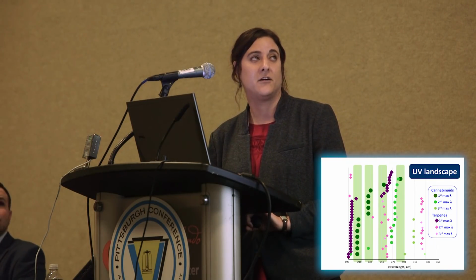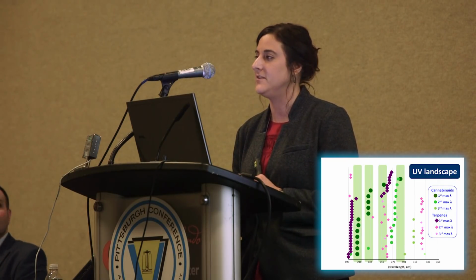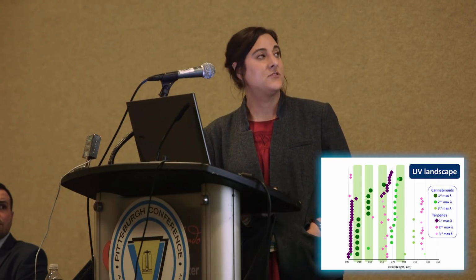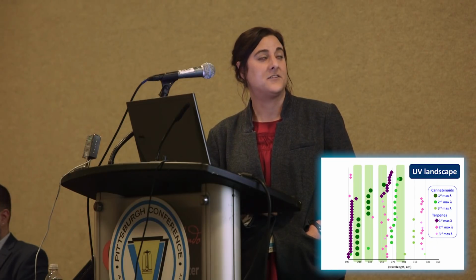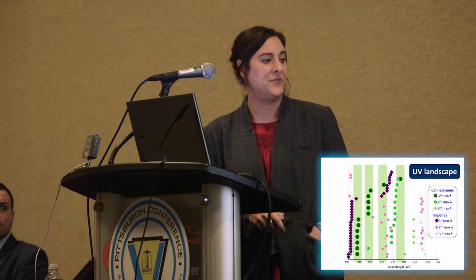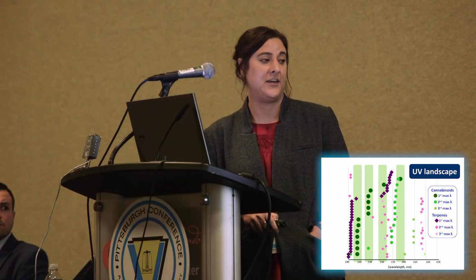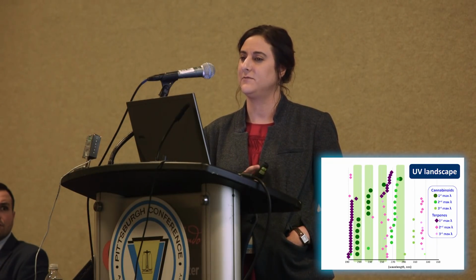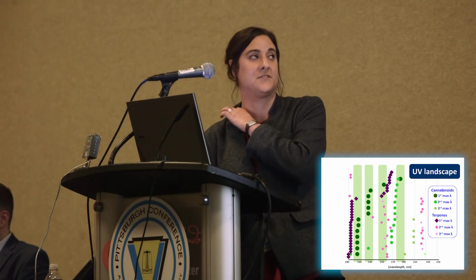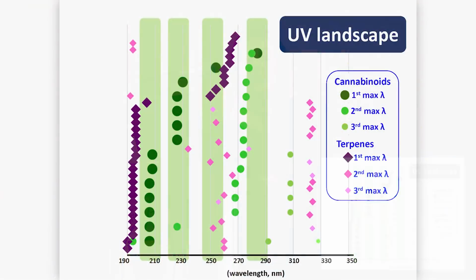So for example, we've tested more wavelengths than this, but these are at least 4 that we've looked at. This terpene was actually not on my radar before in terms of an interference, but you can see that if you are looking in this range down here, which I think most people have moved away from because the terpenes sit right next to it and will disrupt this signal. But this tells me that if I am looking in maybe the 210, 215 nanometer range, this compound is something that I need to consider.